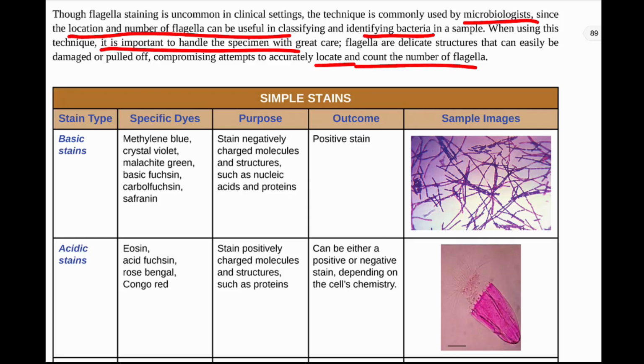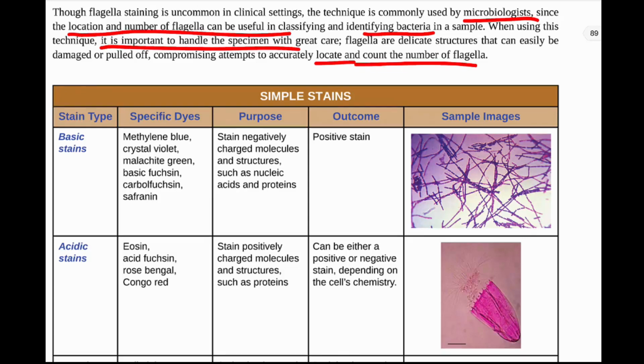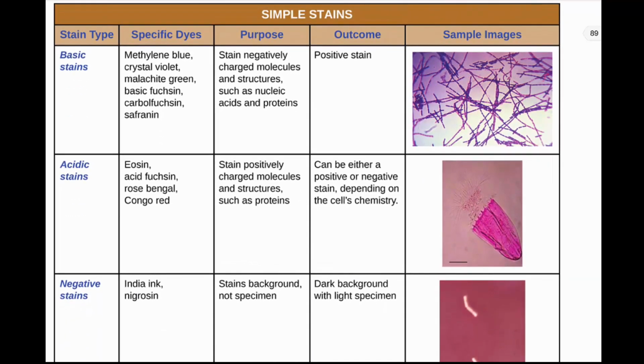The other ones you don't have to be as fragile with. It's of course good to be as careful as possible so you don't burst any cells or wash away your stain, but that one you need to be particularly careful with.